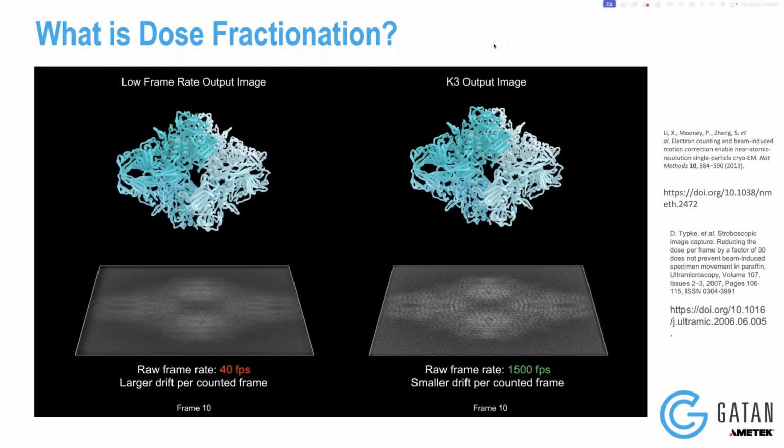You also get a time series of data, which we'll see later, and you have some flexibility in rejecting damaged frames. So this is very established in cryo-EM. It's been around for 10-plus years, and it's a go-to method in cryo. So let's have a look at this one.